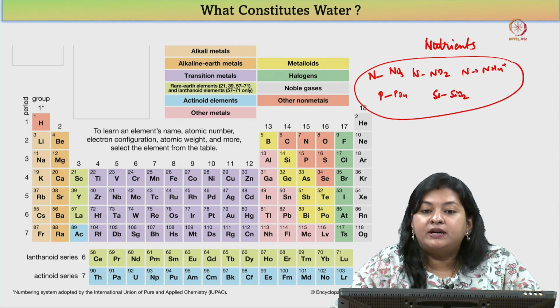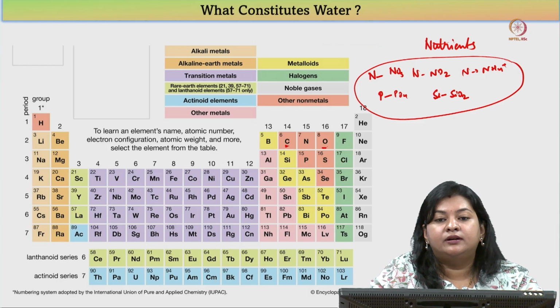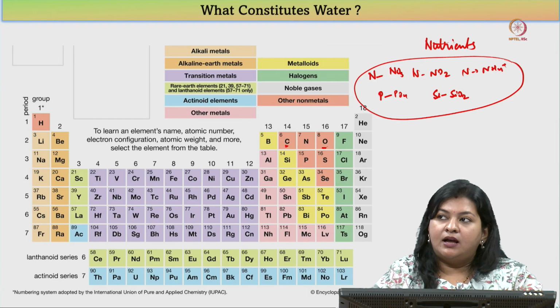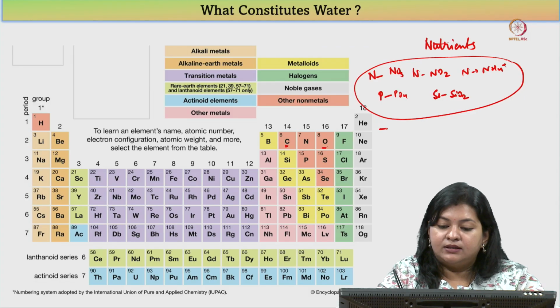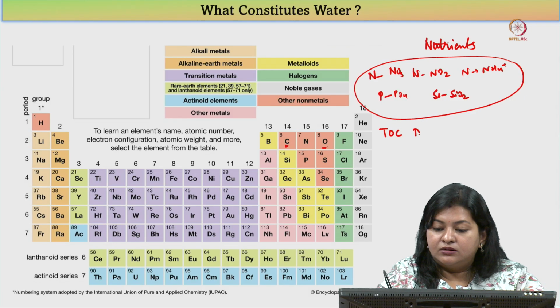Again, there are some more measurements. So, in water we are going to measure oxygen, we can also measure carbon, right. Now, for carbon there are many different types of analysis. The most common analysis that we are going to do is the TOC, that is the total organic carbon, and the dissolved organic carbon.